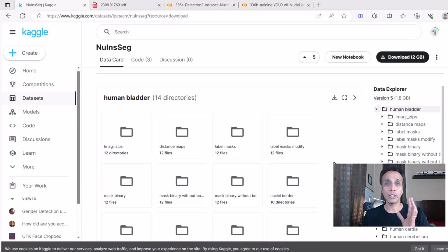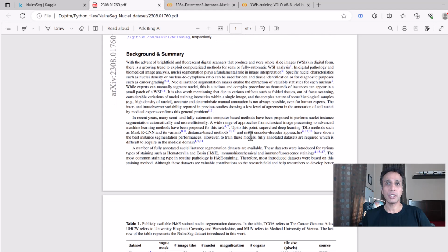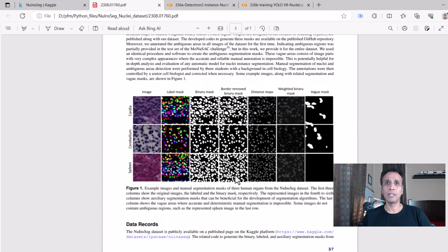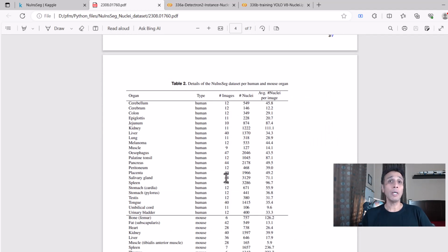So which is going to be our first step. And if you want to know more about this data set, I will also leave a link to this publication. Of course, that's also part of, I believe, the Kaggle, they included that. But either way, I'll leave the link to this and you can read more about this data set. So there you go. That's the plan.